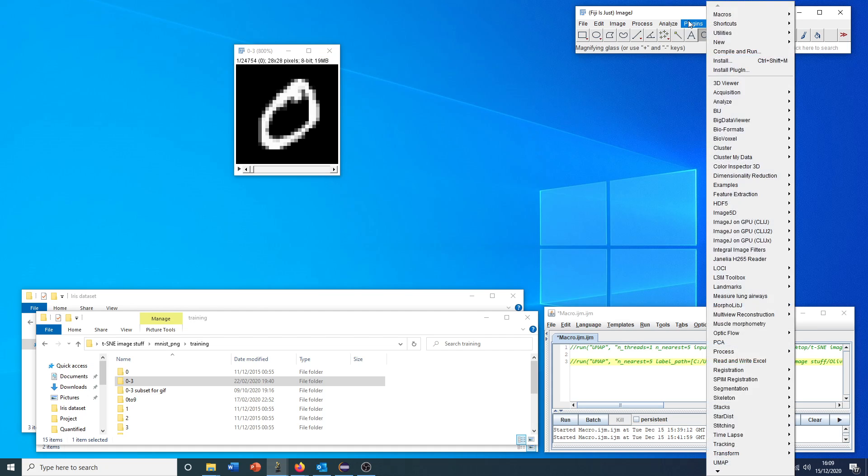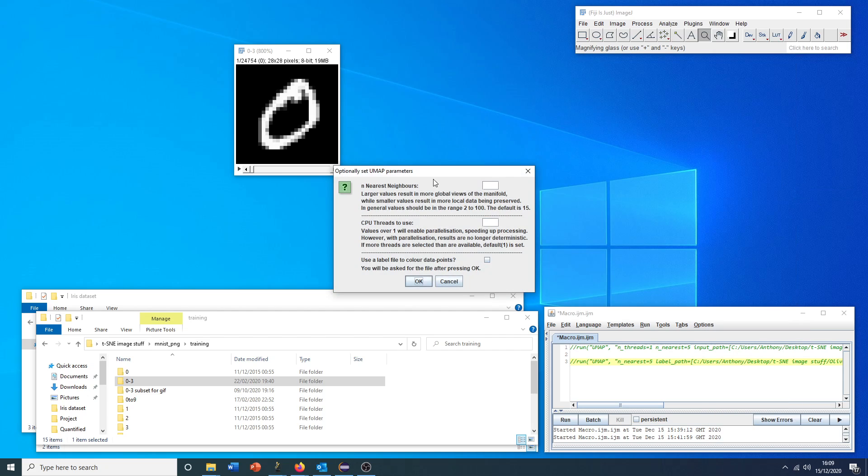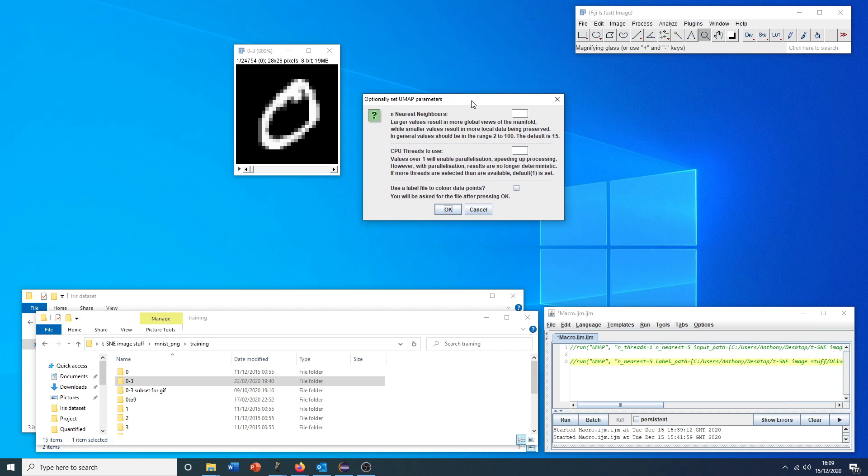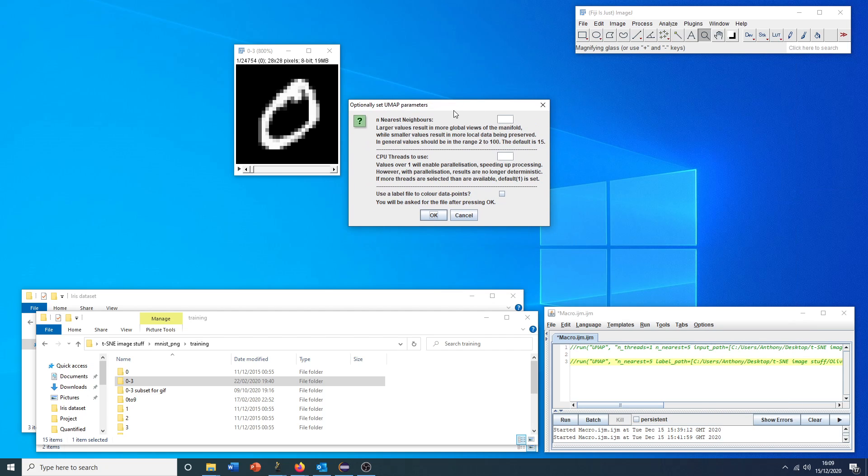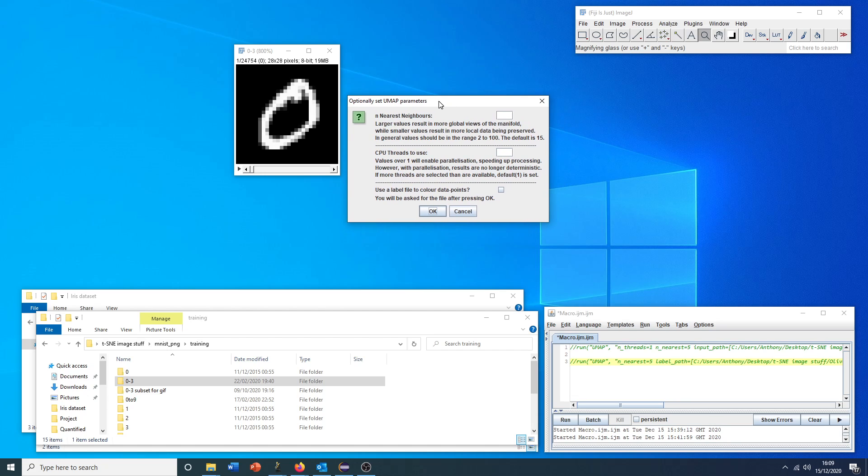With this open, we can go to plugins, dimensionality reduction, pick one of our methods. In this example, we can run UMAP, which is a contemporary dimensionality reduction technique used in a lot of modern bioinformatics papers.